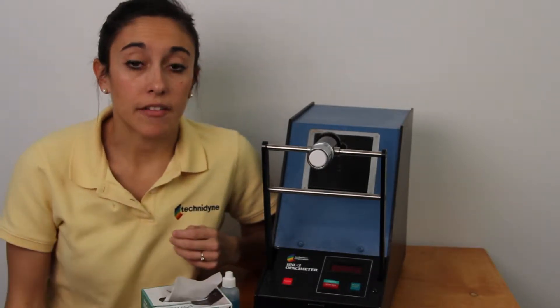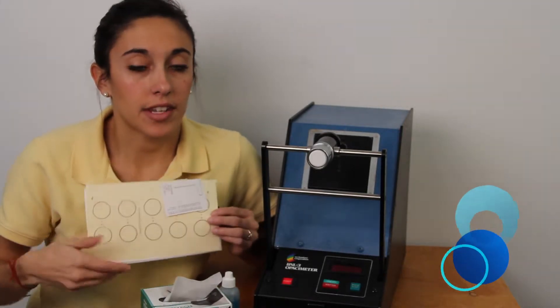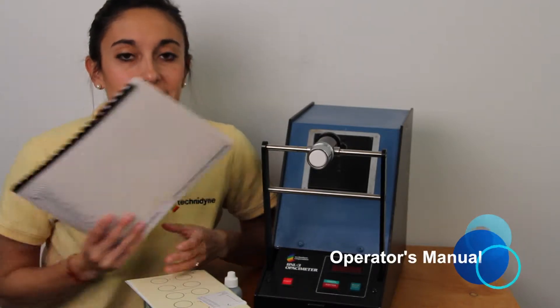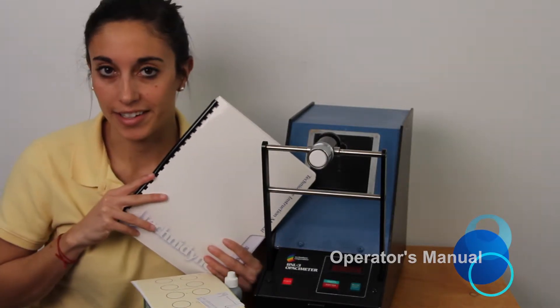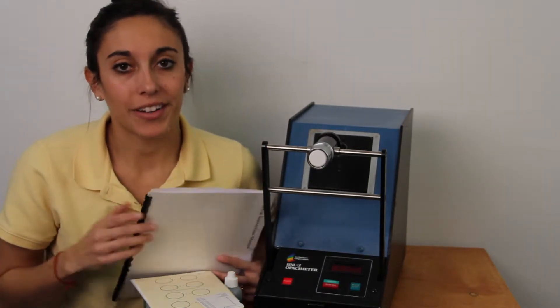The next thing that you should have are your paper verification standards. These consist of three standards in three different ranges. And finally, it's never a bad idea to have your Technidyne Operator's manual on hand. Once you've gathered all these things together and your instrument has warmed up, you're ready to get started.